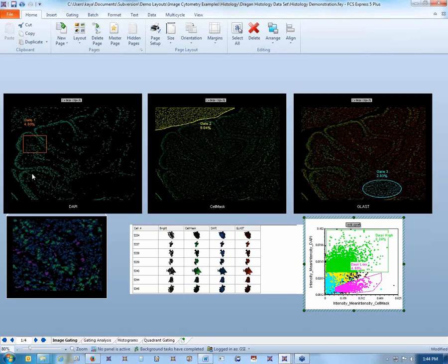But you can see now in this upper right plot the morphological structure of the rat brain that was imaged here. The DAPI high cells are at the edge here, and those are the nuclei being highlighted. And of course, you can move around your other gates and watch the populations update. Just keep an eye on the other picture plots and you'll see them updating.